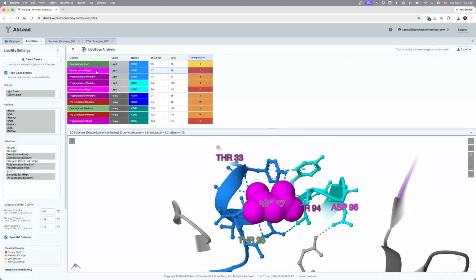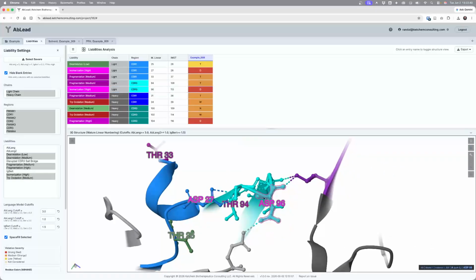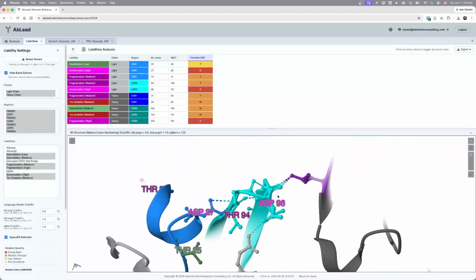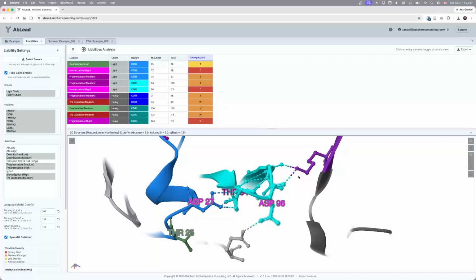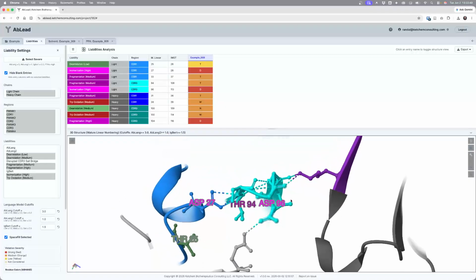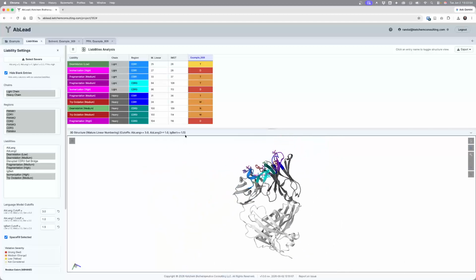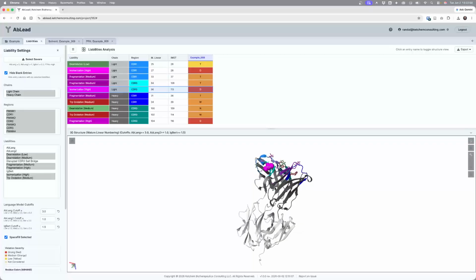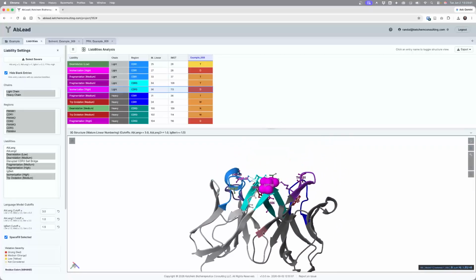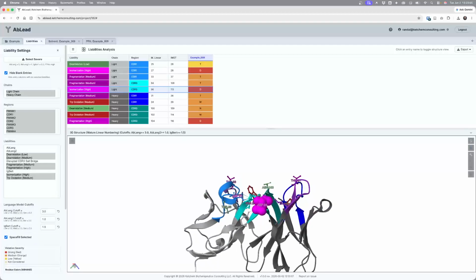Next, we'll look at this position 113. That's linear 96. And if I select this and turn it off so we can see the side chains, it's forming a hydrogen bond. It's engaged in a multi-CDR hydrogen bond network. It looks like it could form an isomerization site, but if I turn that back off, turn that on, it's off to the side. I'm a little concerned about it, but without MAM data, I'm going to leave it alone.